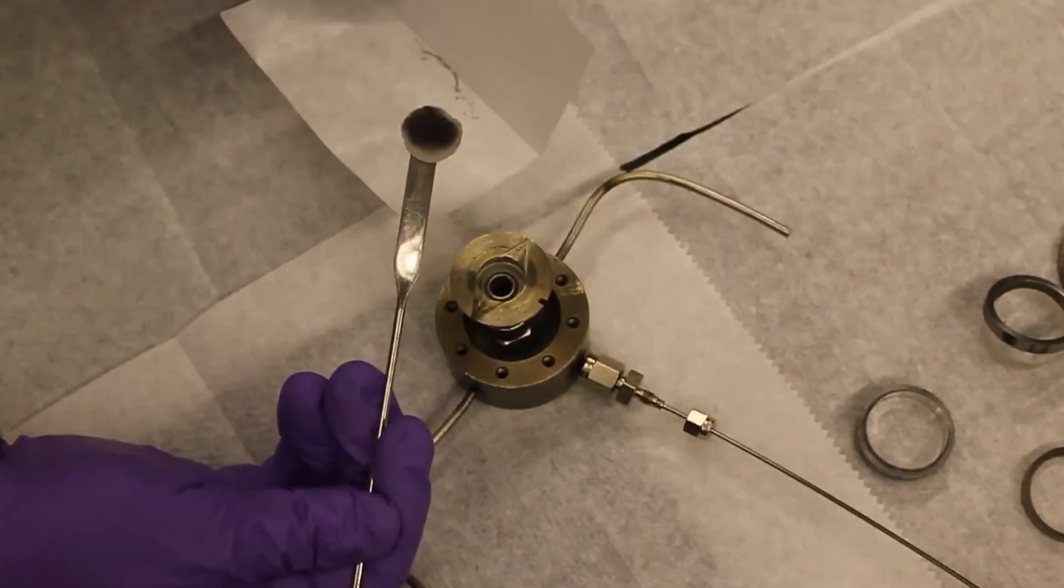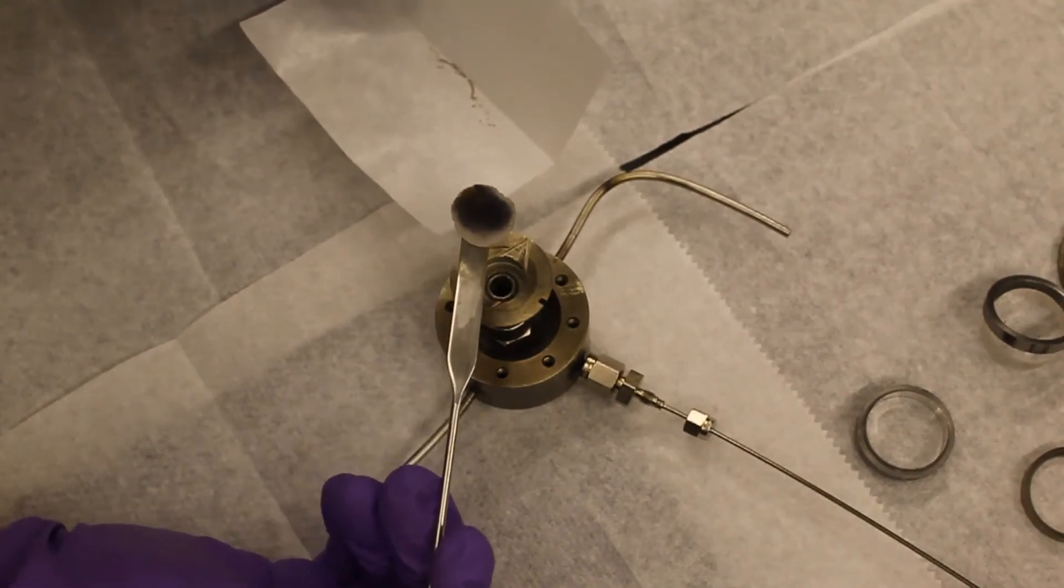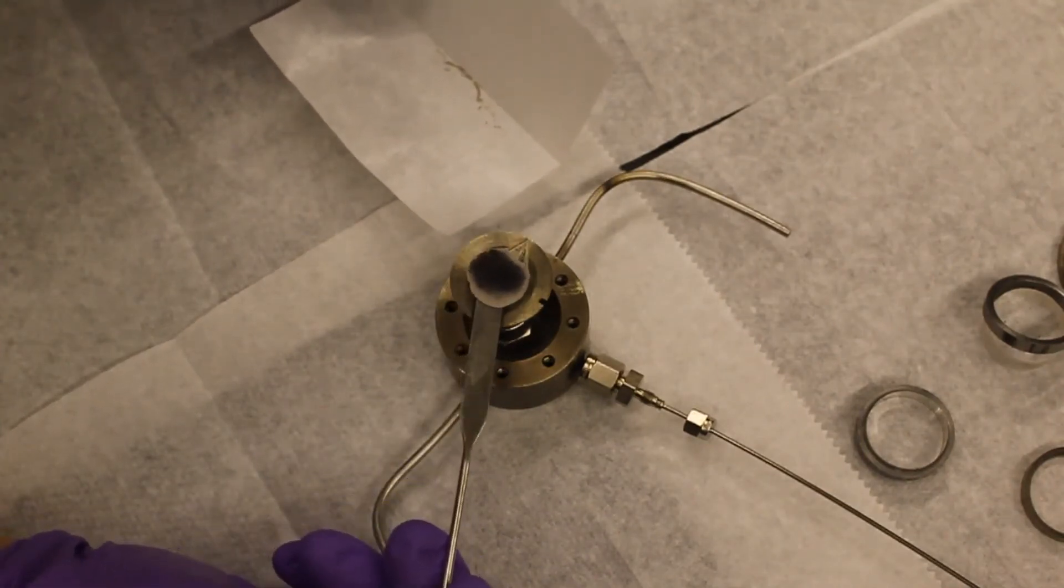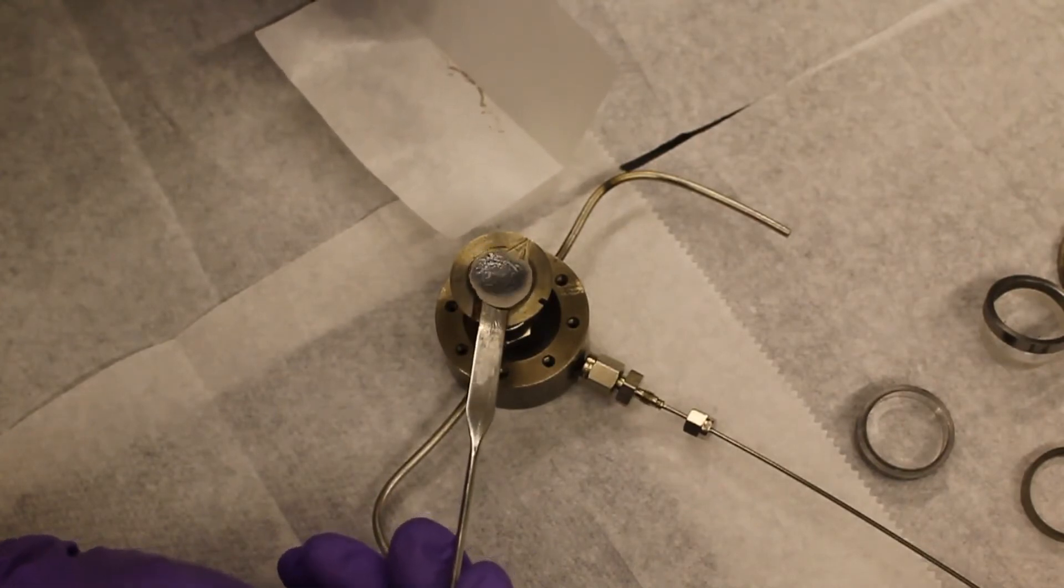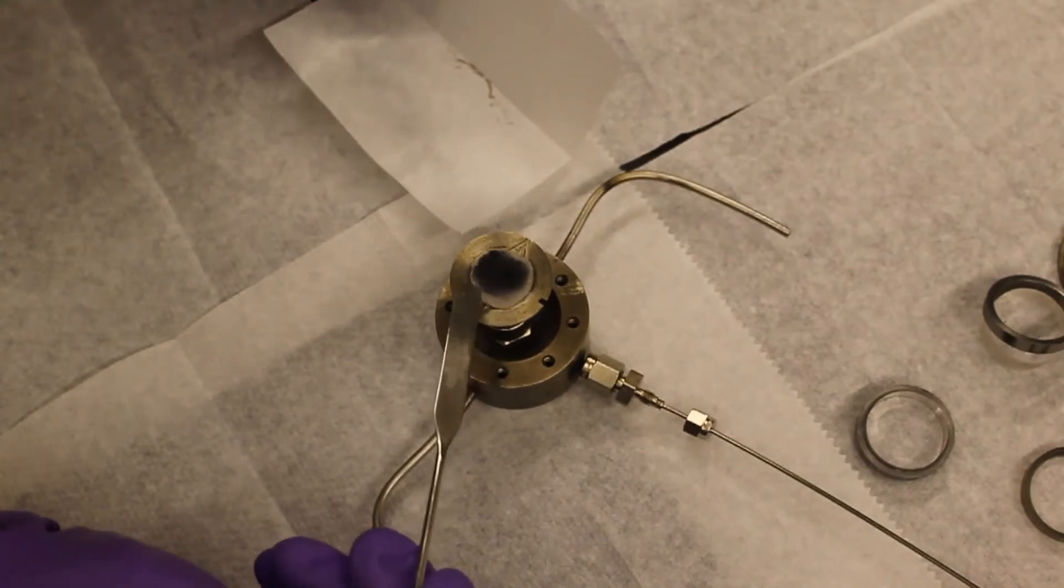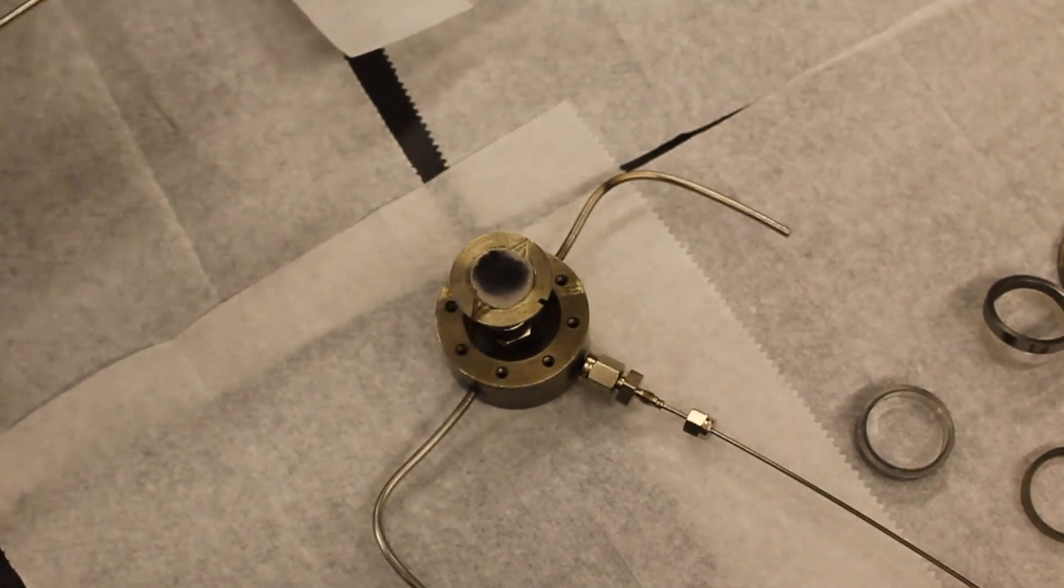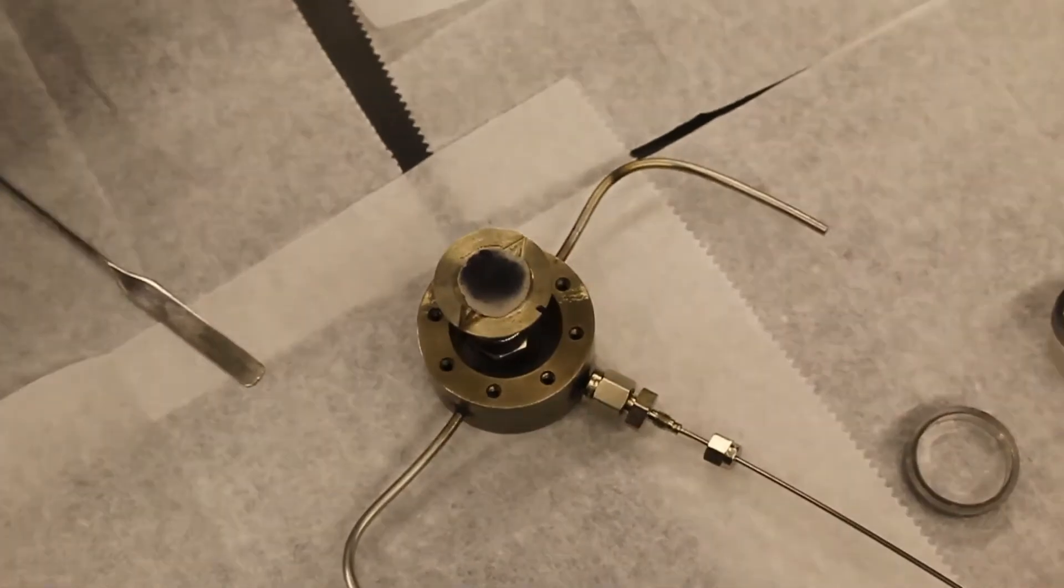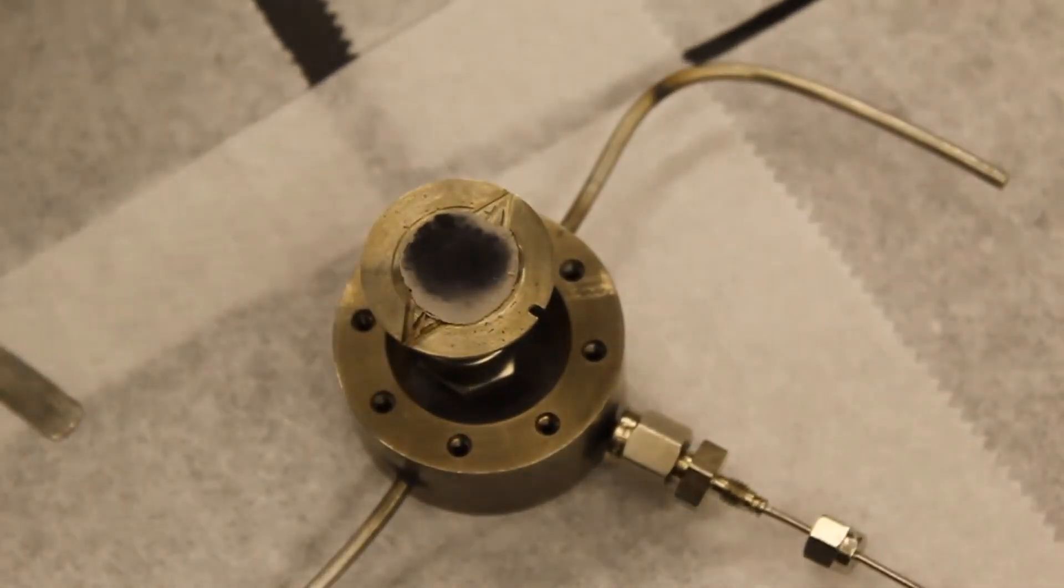Place the sample pellet into the recessed area of sample holder A. The recess should be able to hold the entire pellet. After putting the sample in sample holder A, we measure the weight of weighing paper to obtain the weight of the sample pellet.